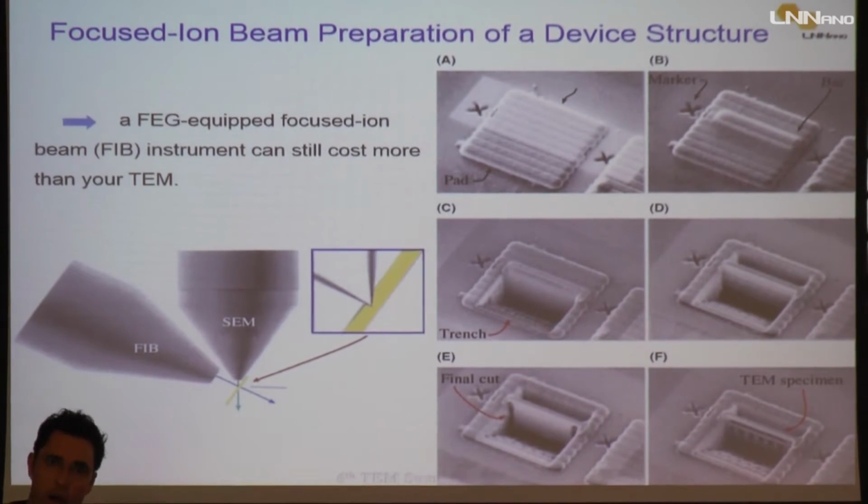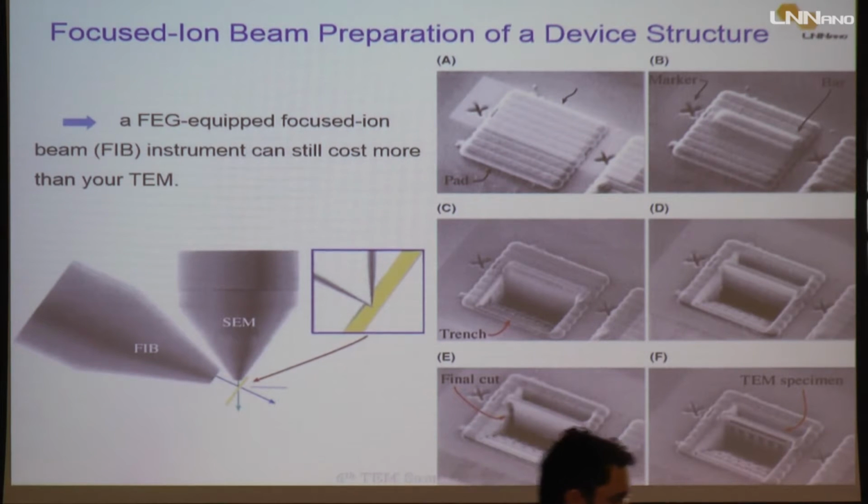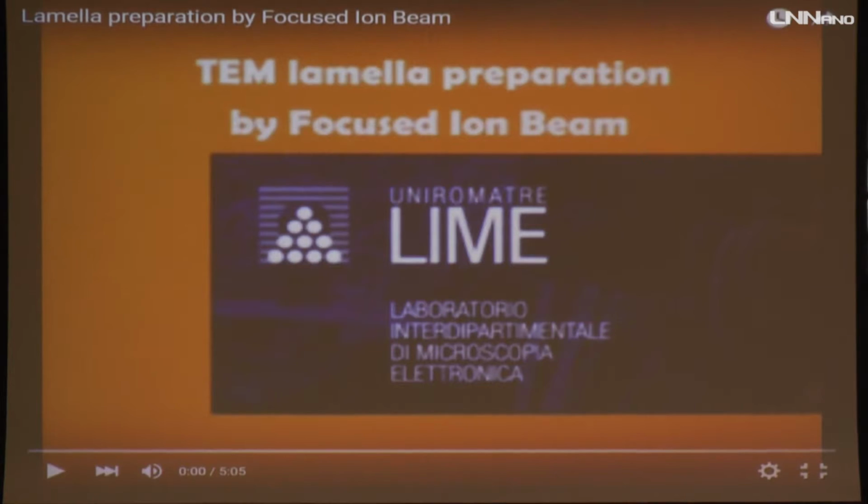I will show a video of a sample preparation that's very interesting because it shows, from the bulk material till the sample prepared, all the steps, and you see information about the time required to do it.